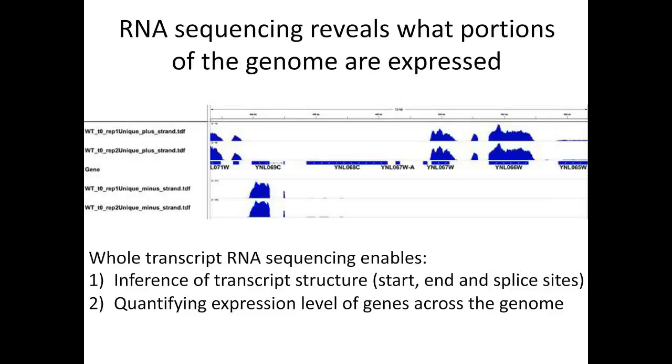So first, what RNA sequencing can show us is really what portions of the genome are expressed. In particular, whole transcript RNA sequencing is a technique in which the entire transcript is fragmented, and then the regions are sequenced individually. This enables us to understand the transcript structure, so we can infer the start site of the gene, the end site, as well as where the transcript is spliced together.